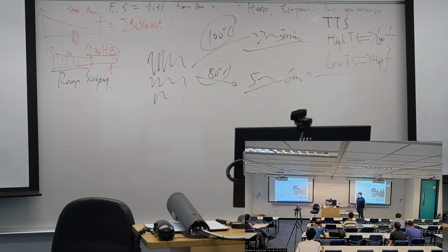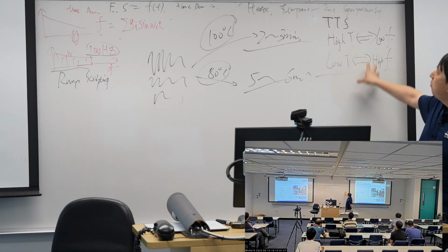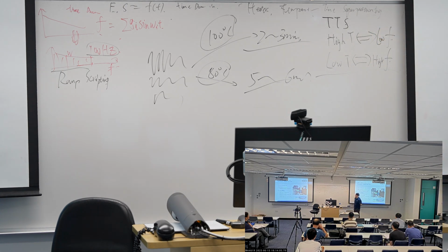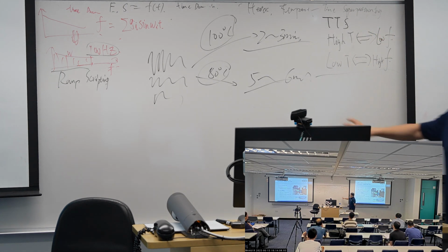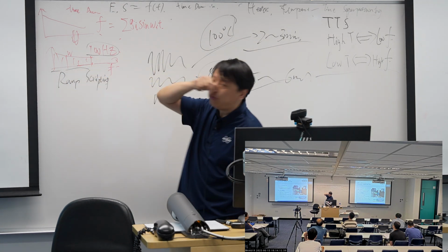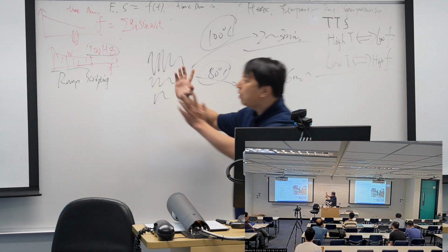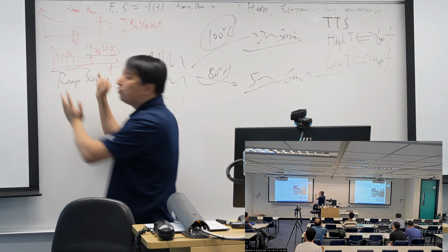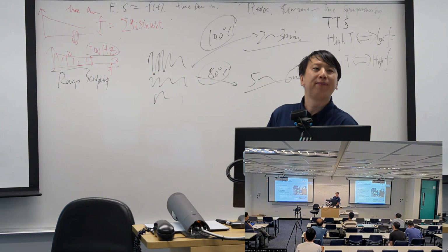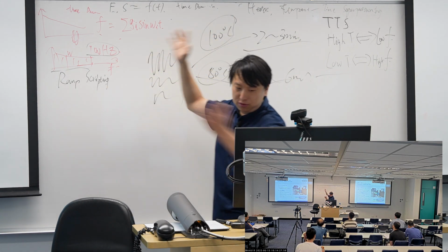So ideally, people use the time-temperature superposition, the TTS, to make the frequency spectroscopy complete, because they can only measure from 0 to 100 hertz. For a long frequency range, you need to change temperature. So people use TTS to make a full spectroscopy.